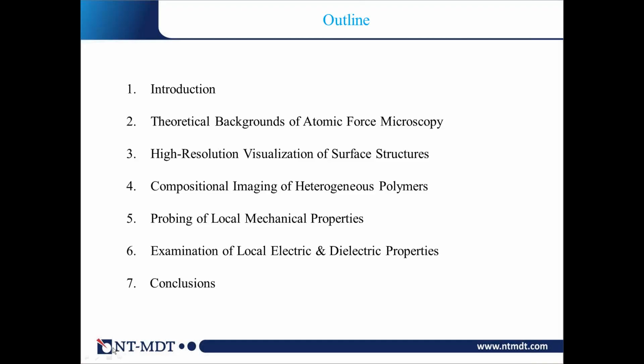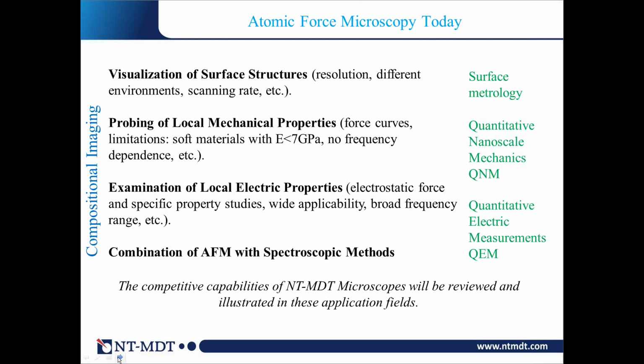The outline of the talk is now on your slide, and I try to overview really the broad application area of atomic force microscopy, and will touch, besides the high-resolution visualization of surfaces, also the issues related to the local detection of different material properties. I will start with some introduction showing what atomic force microscopy is today.